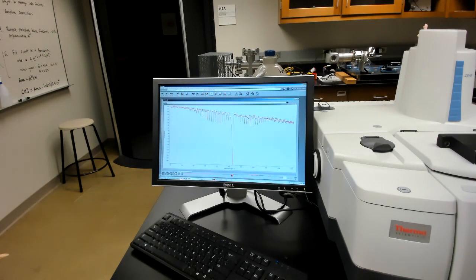Let's go back over to here. There we are. And let me rescale. Okay. Now we can reprocess this using the reference data that we already had, because the reference spectrum we took 20 minutes ago is still perfectly valid for this.